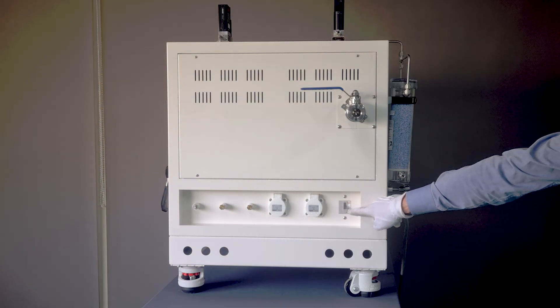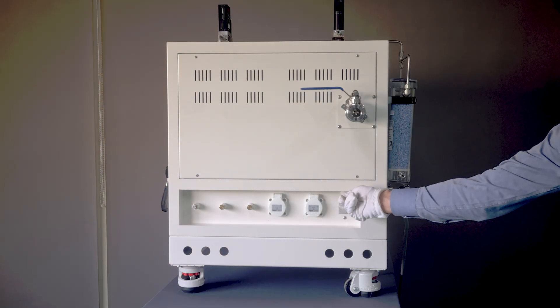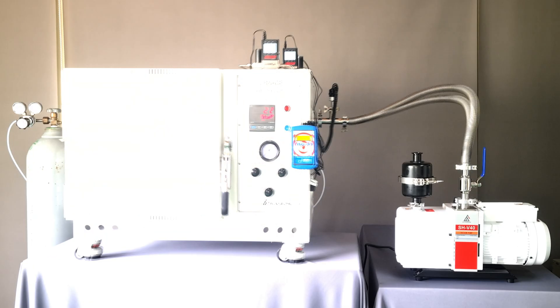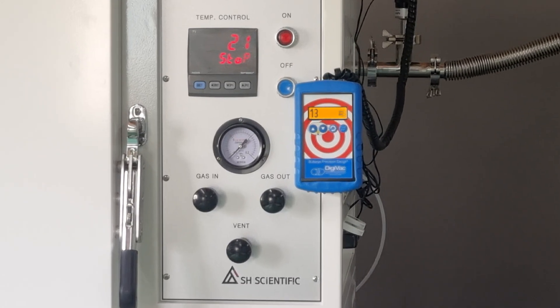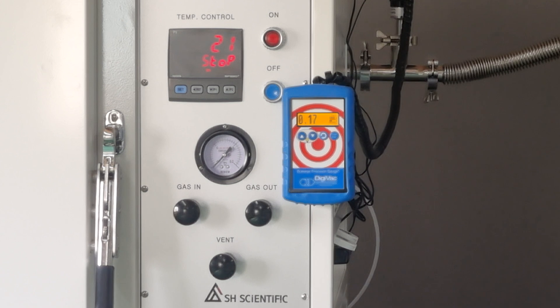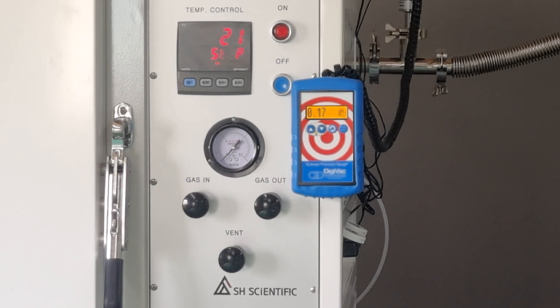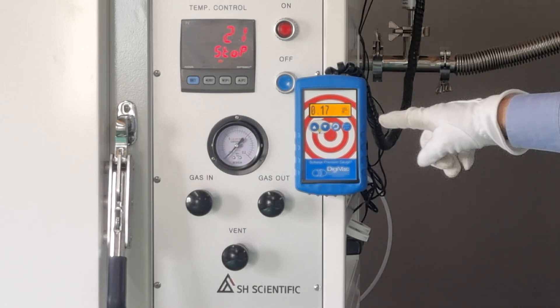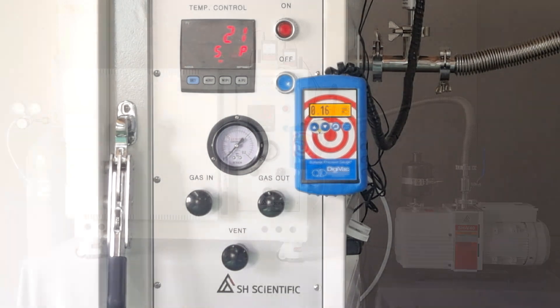Now, turn on the main switch on the side of the furnace. At this point, turn on the vacuum pump and open the valve. Notice how the pressure in the chamber starts to fall. After 5 to 10 minutes, the pressure gauge will stay at the left bottom, or the digital vacuum meter will show 0.1 Torr, meaning the chamber is already a vacuum. You can reach a vacuum as high as 0.05 Torr if you simply let the pump run longer.